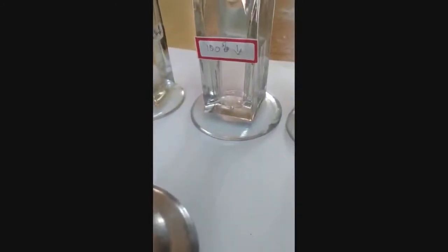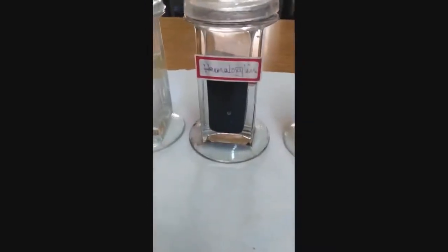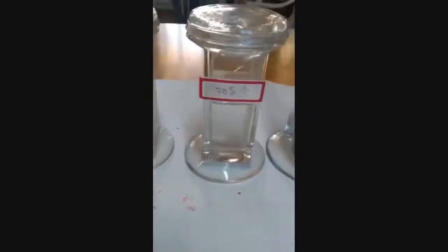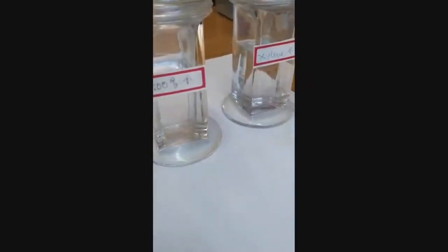I have arranged the materials required for the staining technique: a slide with paraffin sections, chemicals, xylene, to downgrade alcohol grade starting from absolute 90%, 80%, 70%, the stain hematoxylin, distilled water to upgrade 70%, 80%, 90% alcohol, the stain eosin, 100% or absolute alcohol, xylene and DPX and cover slips to mount.